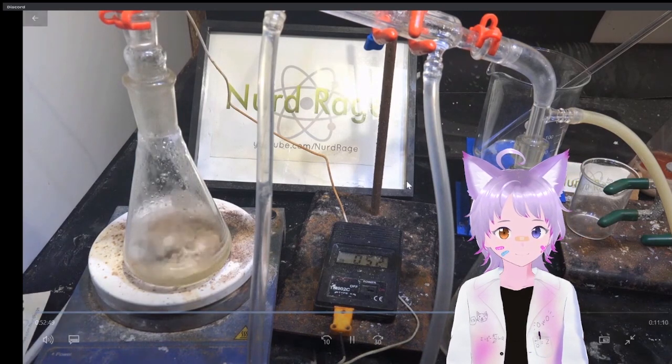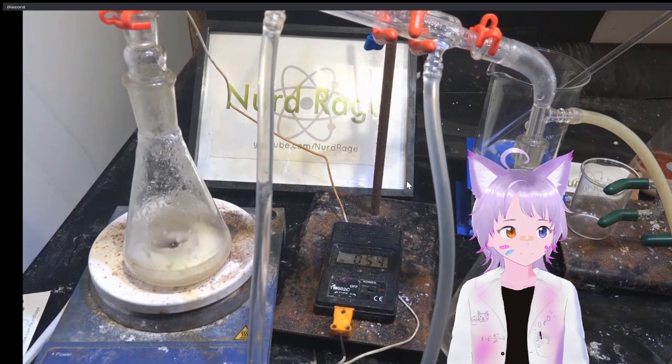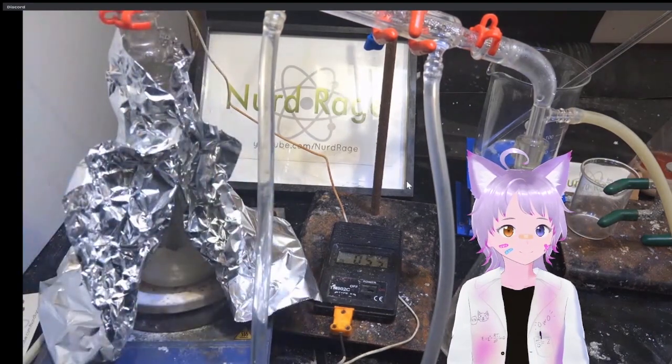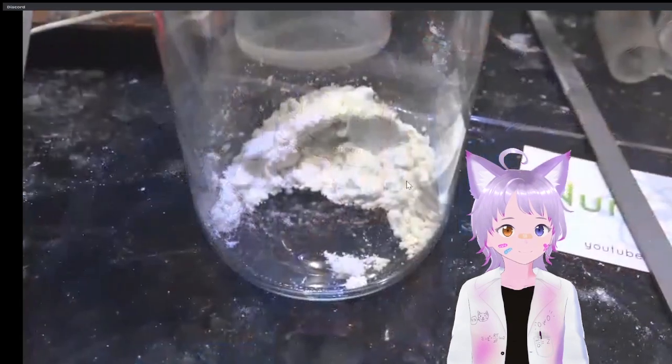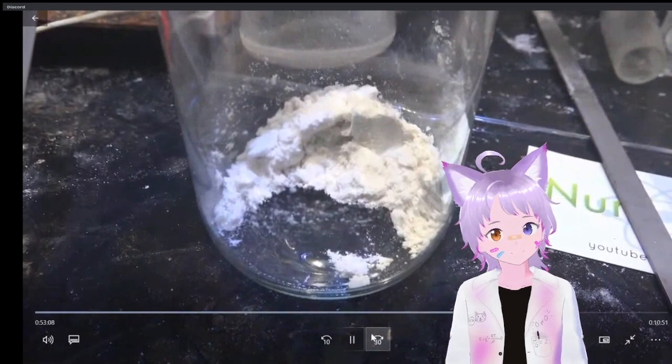I set my hot plate to about 130 Celsius and also enclosed the boiling flask in a foil shroud to keep the heat in. After the last drop comes over, let it run for another hour to ensure the guanidinium chloride is as dry as possible, and quickly transfer it to an airtight container. And there it is, guanidinium chloride.